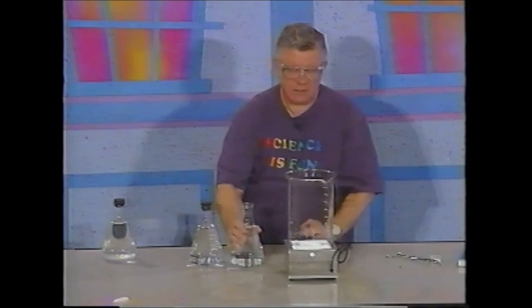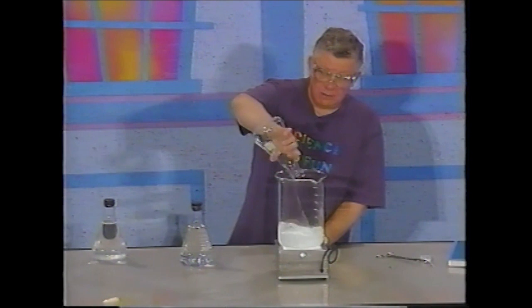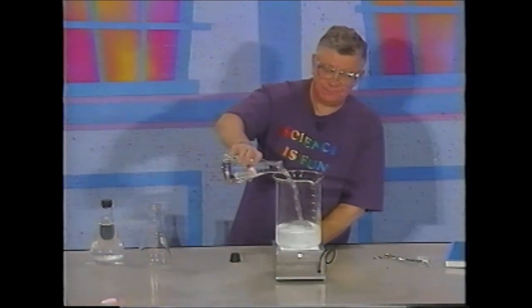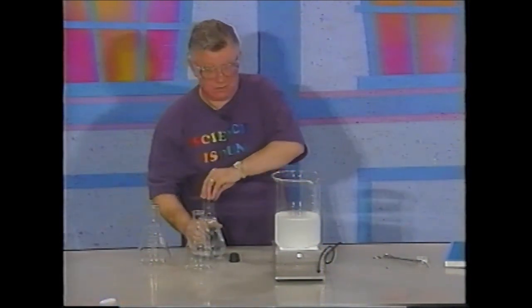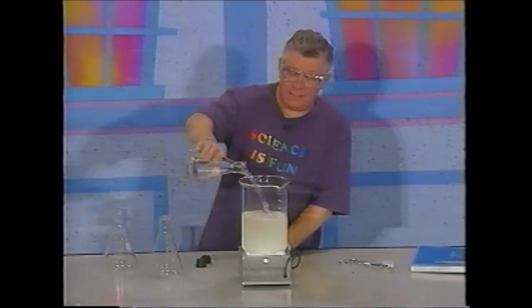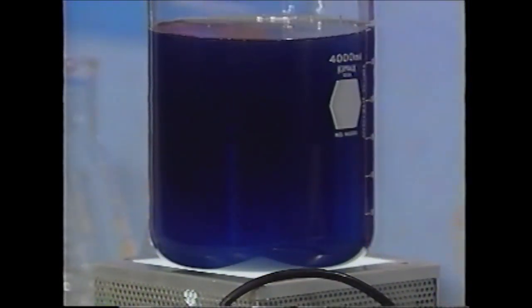Yeah, all right. So what I'm going to do now is mix different liquids in this large 4-liter beaker. The first one is a clear and colorless liquid, although now you can see it's not as clear. It's somewhat cloudy. And the next liquid is clear and colorless. I add that. Anything interesting happen so far? Well, the volume increased. That's not terribly interesting. It's relevant, but not very interesting. I add the third liquid, and you see that there is a change.